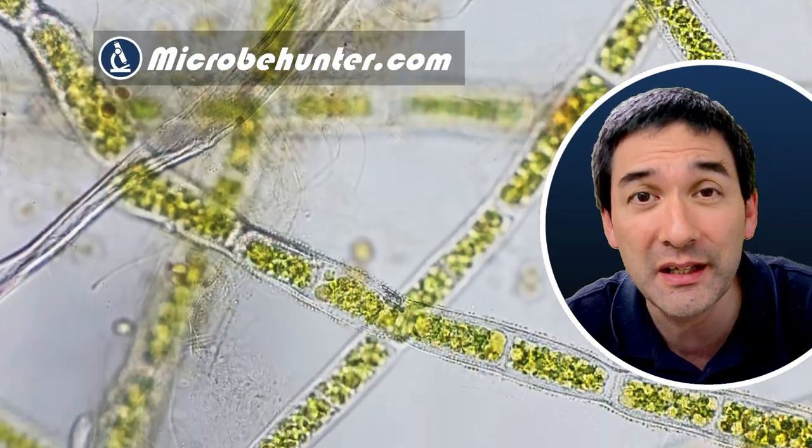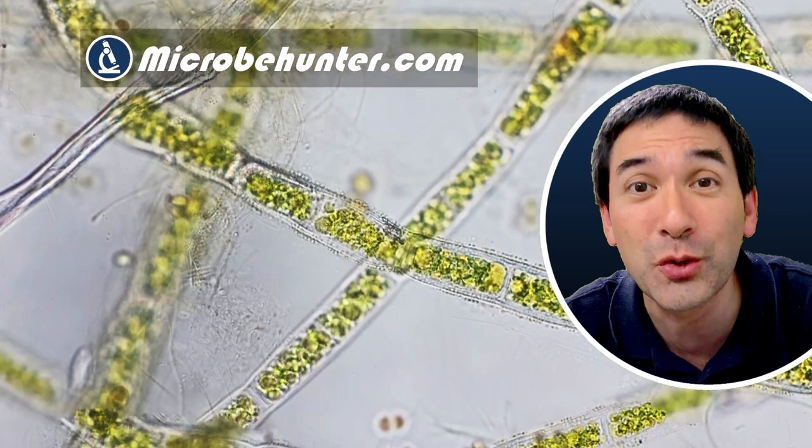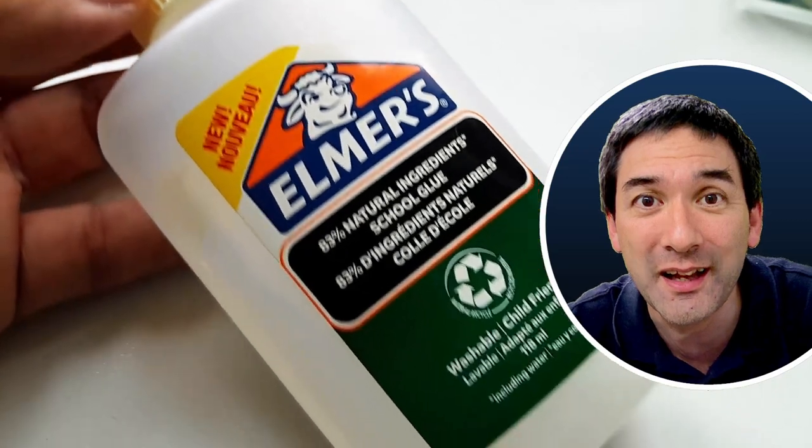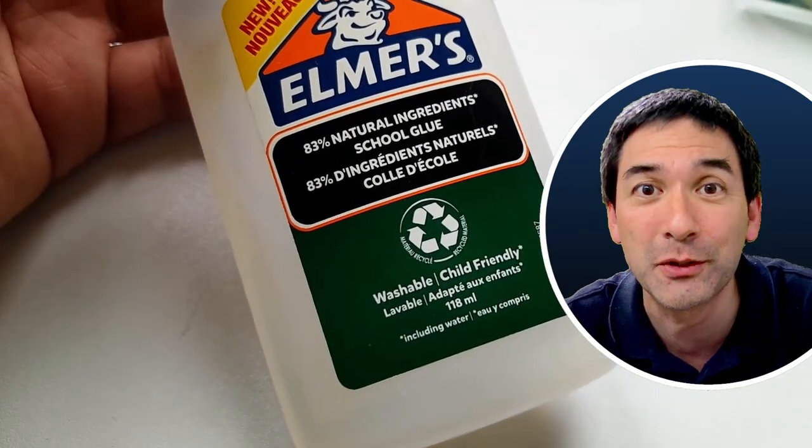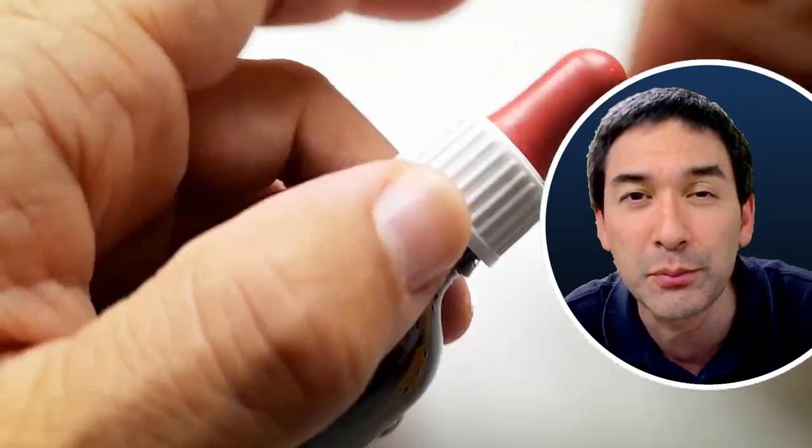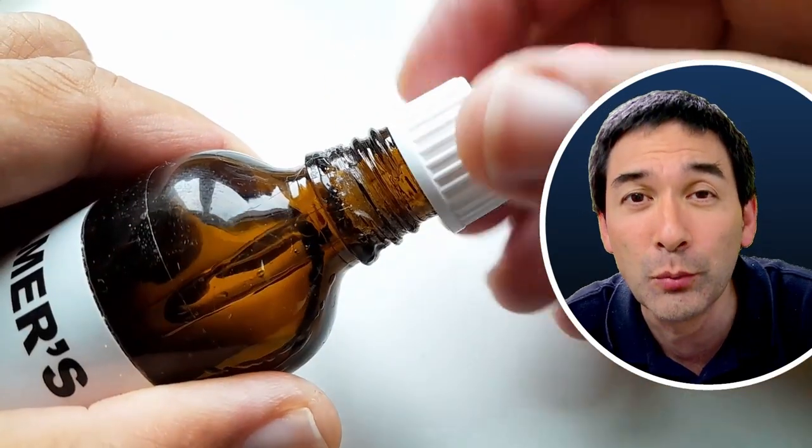I'll be using a mounting medium which is quite readily available. No fancy and poisonous substances, but rather some glue, some children's glue which I diluted down by adding approximately 10 to 15 percent water to make it a little bit more liquid.